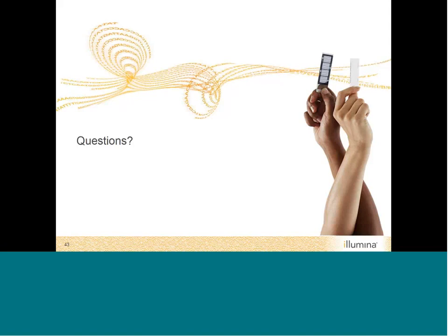That's one type of control. Other types of controls could be DNA that has a very specific defined variant. For instance, Horizon might be selling controls like that, which have defined variants that you could run through the library prep and then the analysis. So these are different types of controls, depending on what you're looking for.